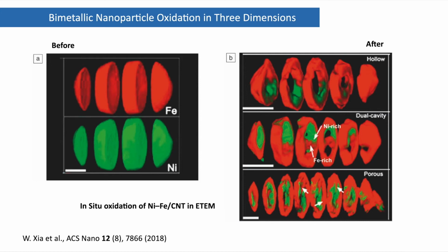The findings in this work showed that metal concentration, diffusivity, and particle size are all important parameters that dictate the mechanical and phase stabilities of a hollow oxide shell.